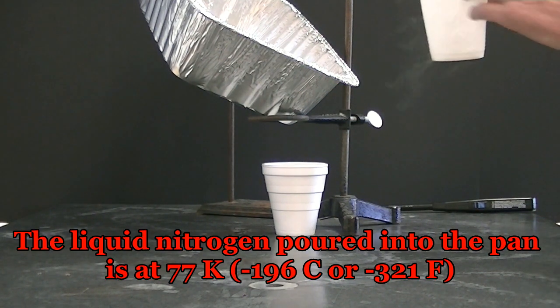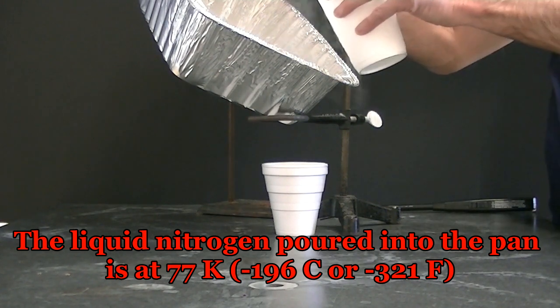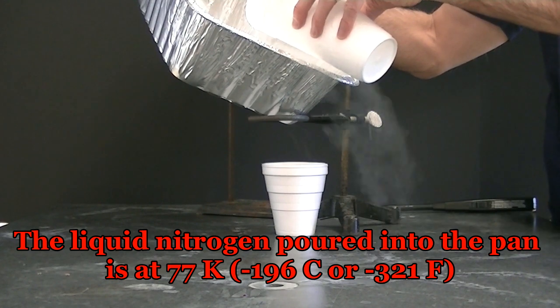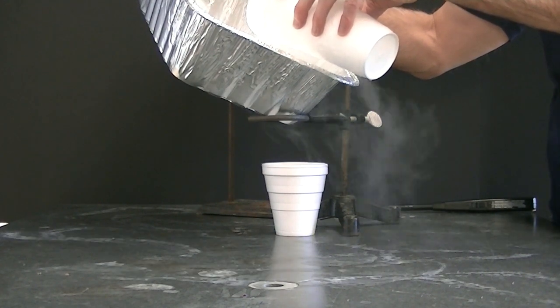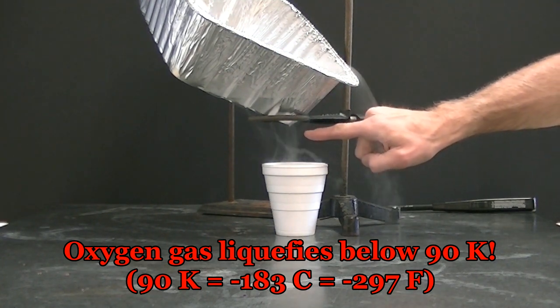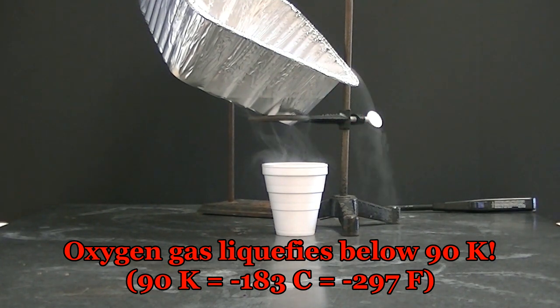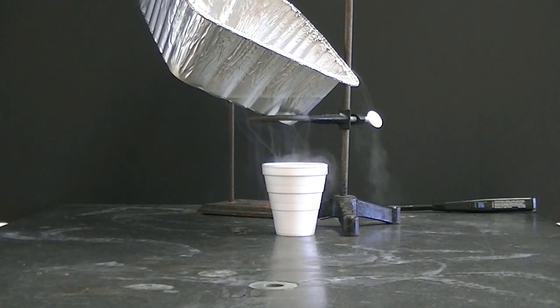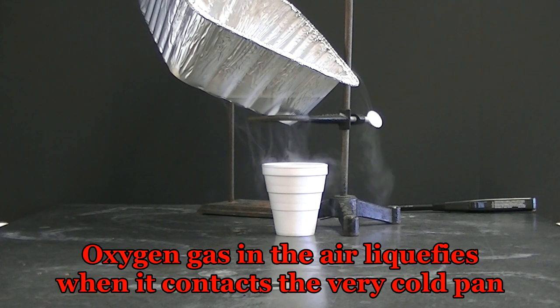Under the pan I'm going to pour some liquid nitrogen which should cool the pan to well below 90 Kelvin, which is the condensation point of oxygen. And you might notice very rapidly some drips starting to fall into the cup and you can hear it dropping. Those drops you see falling are drops of liquid oxygen.